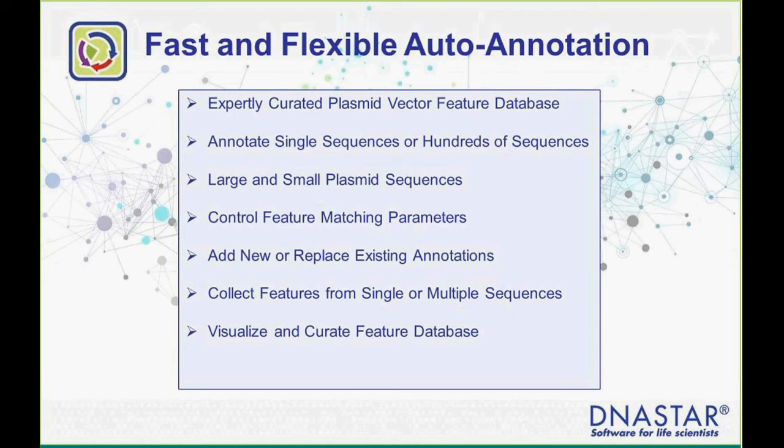And that's a very, very important piece of functionality so that you can further confirm and make sure that the annotations that are being added aren't already there on your sequence or are the type of annotations that you want to add. And so this database then can also be expanded.